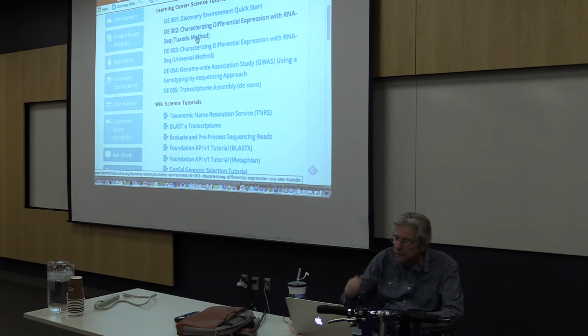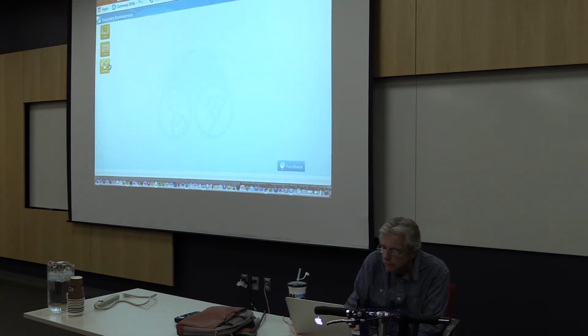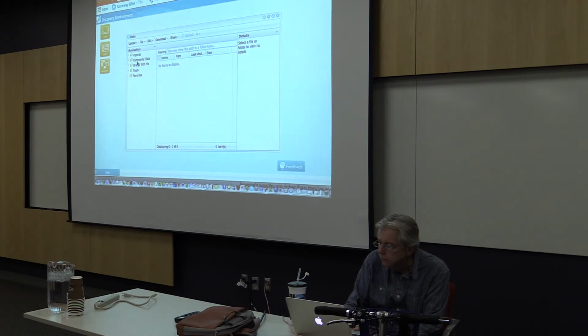But let me take a little time now to show you what your end results are going to look like, because that's important if you haven't looked at this sort of thing before.